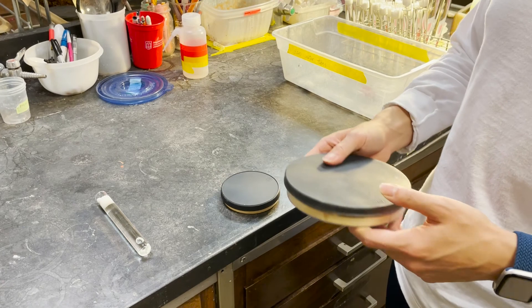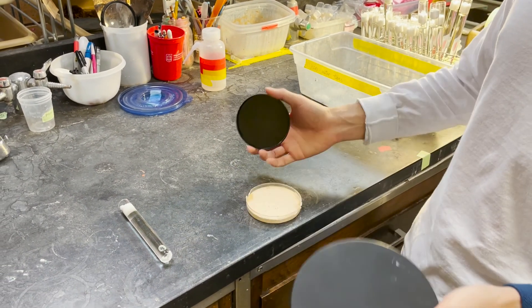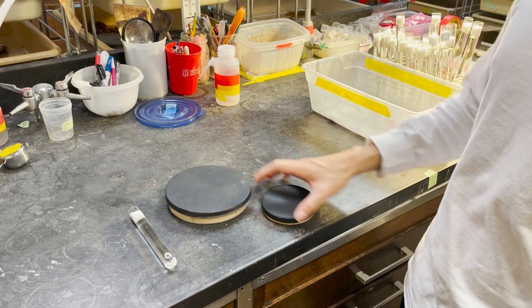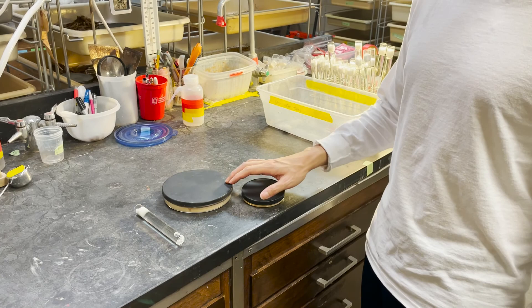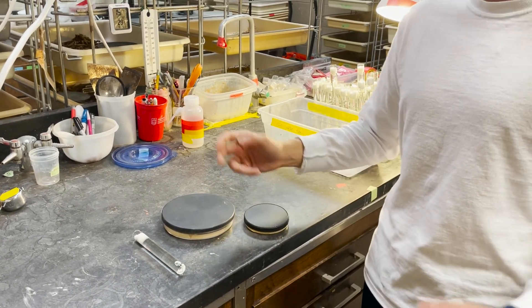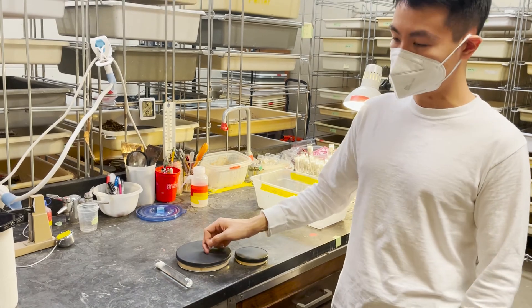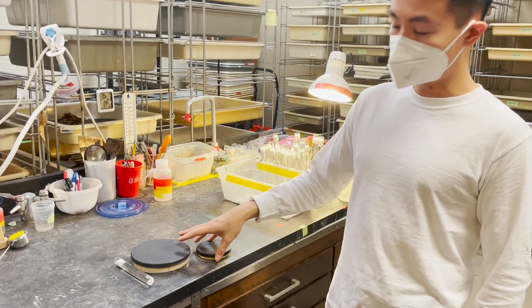Depending on how big the colony is, you can give them more or fewer nests, and a smaller or bigger one. A key thing is to really adjust the living space. If a colony is too small, you don't want to give them a big nest because they would feel stressed — the space is too vast and they don't feel secure. If the colony is getting bigger, you give them a bigger nest or add another nest into the tray.